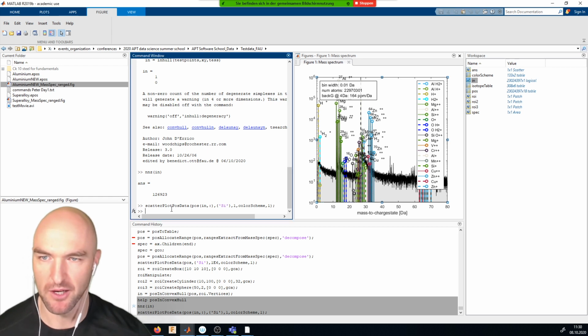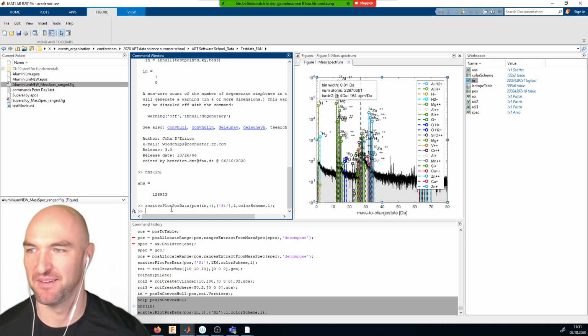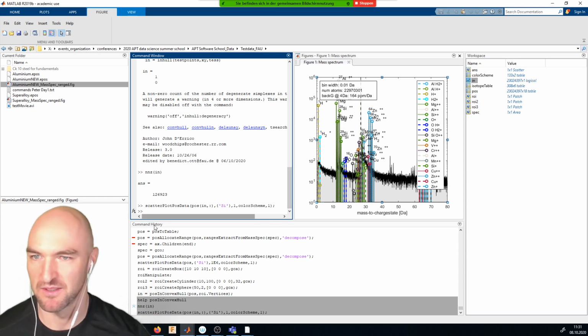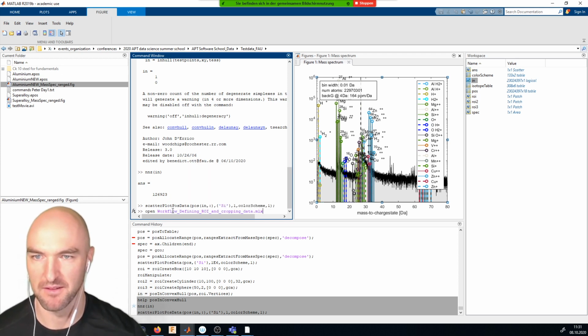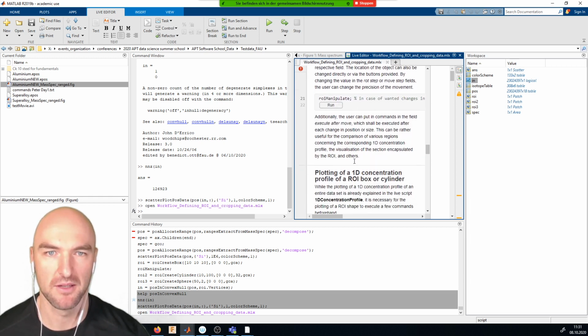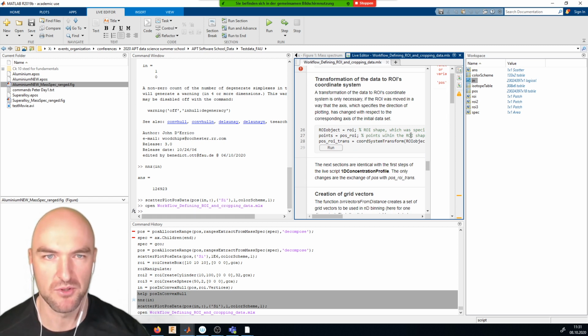And this is obviously the next thing we're going to do. So can any one of the tutors remind me what the coordinate system transform is called now? Maybe I could just open the MATLAB live script for that. Cylinder, row, sphere, cropping, manipulating, transformation. It's just called coordinate system transform. Okay.